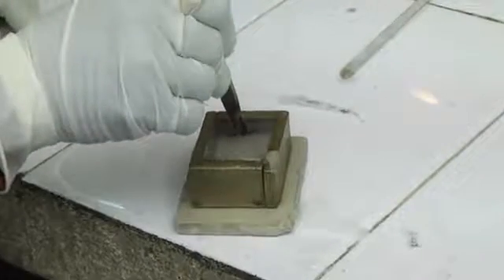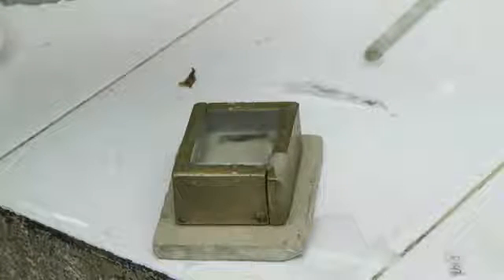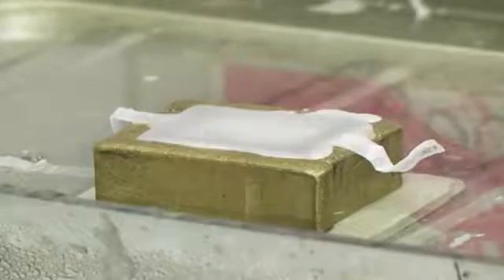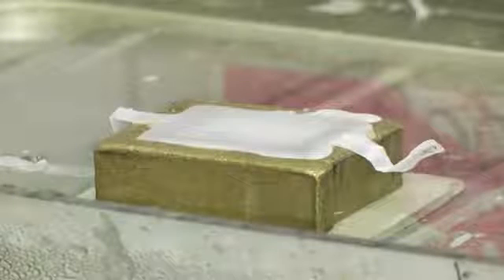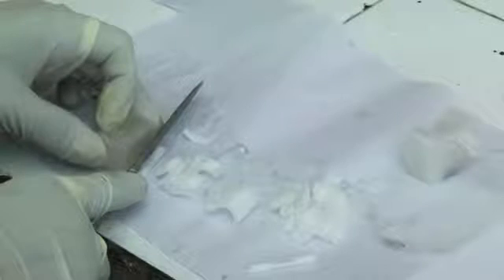It is important for the technician to have a sound knowledge of basic histology and tissue orientation to be able to embed in the correct plane so that all layers of tissues can be visible on the slide. The melted paraffin is allowed to harden at room temperature. After hardening, the metallic molds are removed and the blocks are properly trimmed. Then, the blocks are kept in the ice chamber of a refrigerator for some time before cutting the sections.